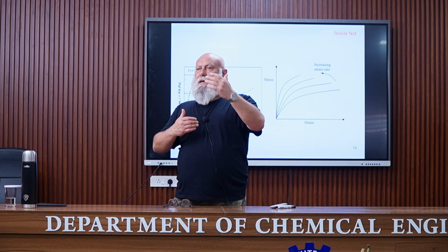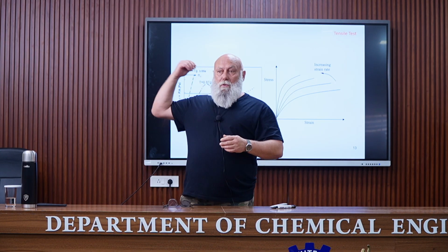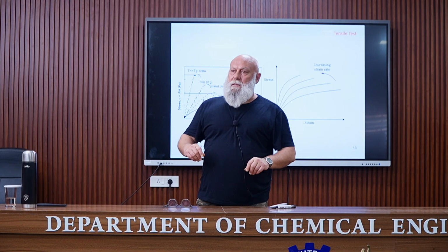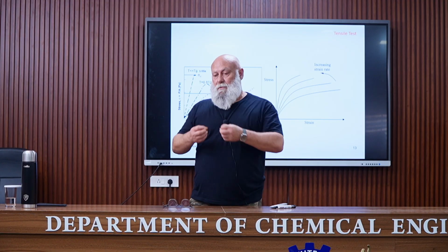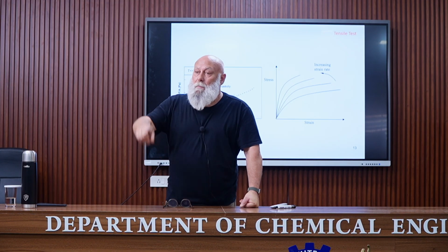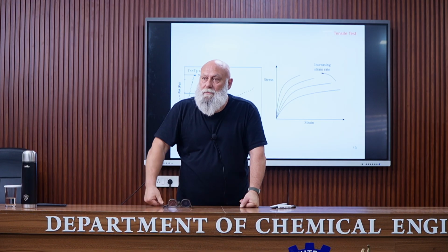And so at the end, we obtain what is called a mesomorphous structure. In the video, I show you that we have some filaments at the end of the test. It's because of this rupture of the crystalline lamella, because it was high-density polyethylene, so it's a semi-crystalline polymer. But the relaxation time is associated to the amorphous domains.